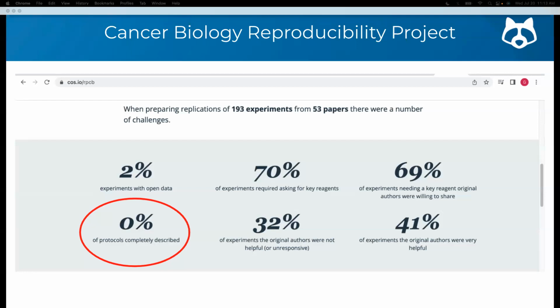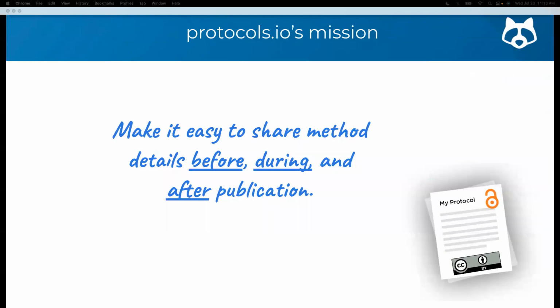This is caused, among other reasons, because people move from labs, students graduate and leave, postdoctoral researchers become faculty elsewhere, and so on. Therefore, we thought that a system for the proper storage and exchange of detailed experimental protocols was needed.